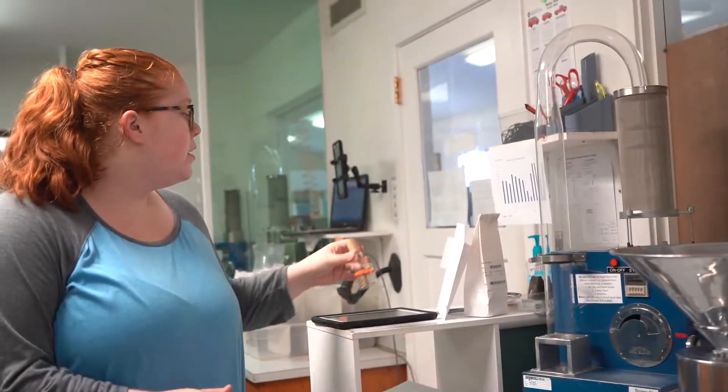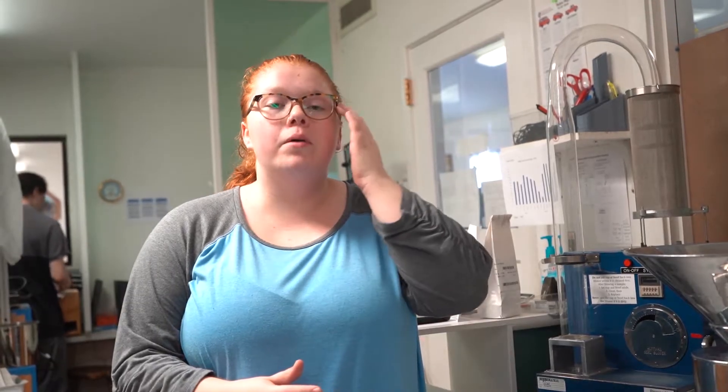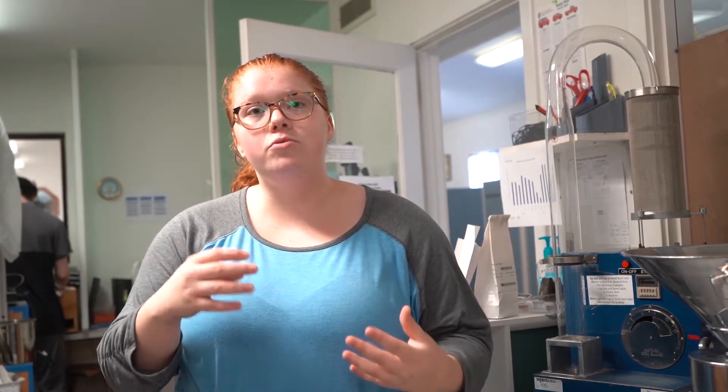When we get every sample in, we want to make sure that we homogenize the sample and that we get a representative portion out of it that is uniform, so that we make sure that we aren't being biased when we are doing the examinations. It's really important that we have a homogenous sample and one that is statistically representative of what has been sent in to us. Otherwise, we could be reporting false percentages, so it's important that we keep all of our procedures standardized and that we do the same thing every time.